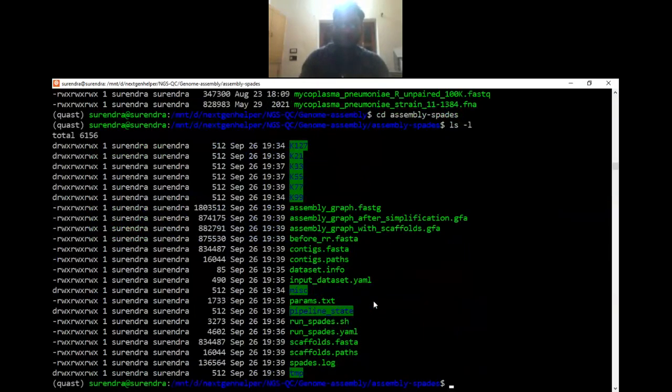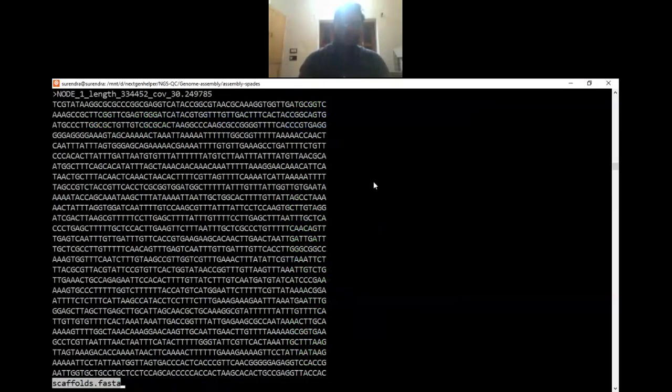So if we go here inside, and if you check the scaffolds.fasta file, okay, sequences are different, like length is different, and also the coverage, right?